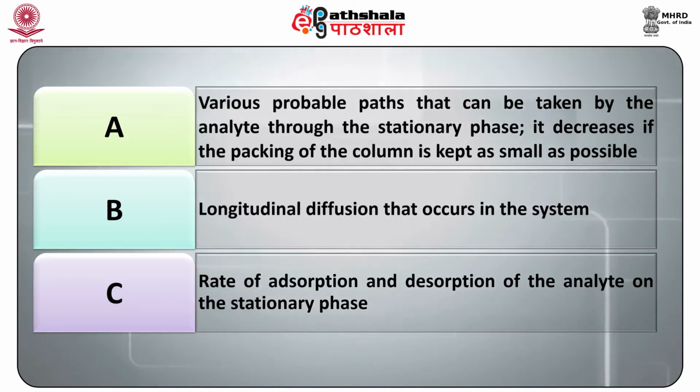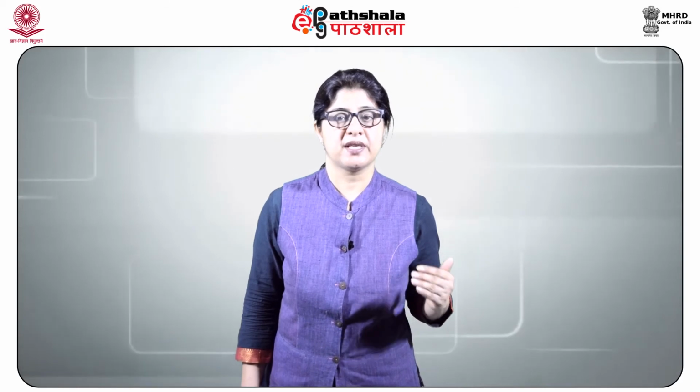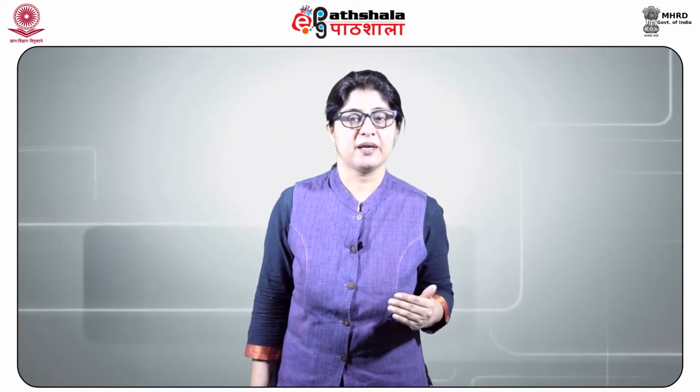A is a constant which signifies the various probable paths that can be taken by the analyte through the stationary phase. It decreases if the packing of the column is kept as small as possible. B is a constant that describes the longitudinal diffusion that occurs in the system. C is a constant that describes the rate of adsorption and desorption of the analyte on the stationary phase. A, B and C are constant for any given system with the same analyte, stationary phase and mobile phase.